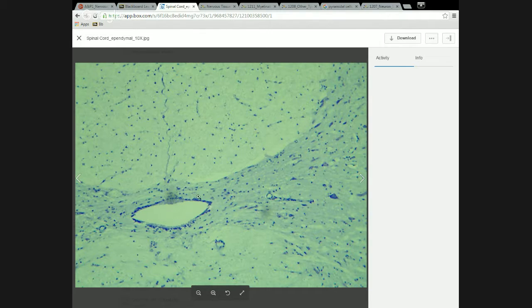They kind of look like an epithelium, but they are not an epithelium. These are glia, nervous tissue. But in the central nervous system, because of the blood-brain barrier, we have a different type of fluid filling the extracellular space. In this hole here, as well as perfusing into the tissue around it a little bit, is cerebrospinal fluid. That's made by ependymal cells, not these ependymal cells but ones in a different part of the brain. There are ependymal cells that make that fluid specifically, but that's what they look like.